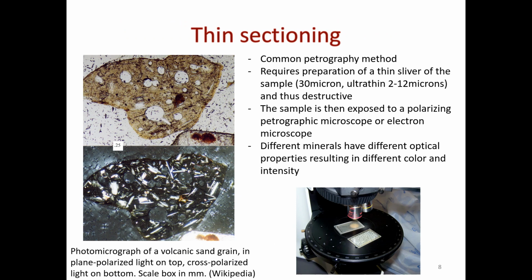Okay. So thin sectioning is probably to date still the most common petrography method, and it's also used in petroleum engineering. It's a standard method of going through basically all of the core or the drill cuttings in a well and doing thin sections of them.